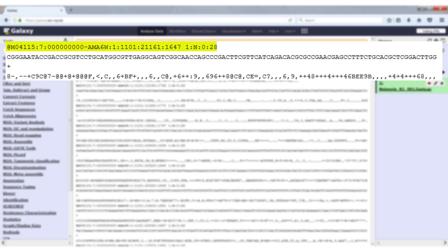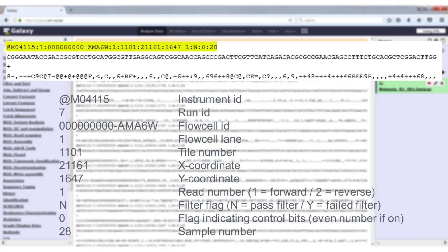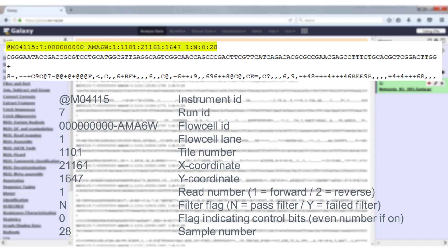The first line is the identifier. It contains a lot of information such as the instrument ID, location and so on. One value that might be particularly interesting is the read number which tells you if the read is a forward or reverse read. The forward reads have number one, the reverse reads have number two.